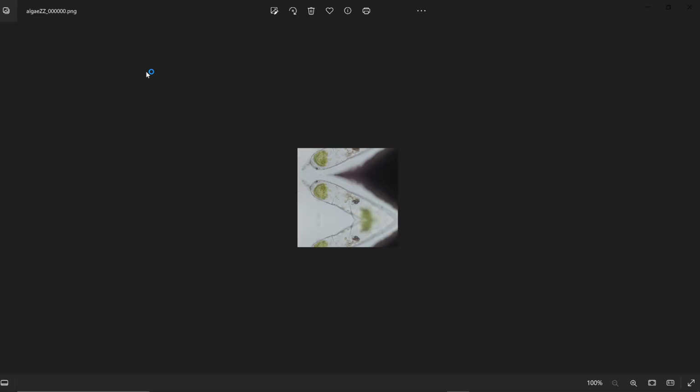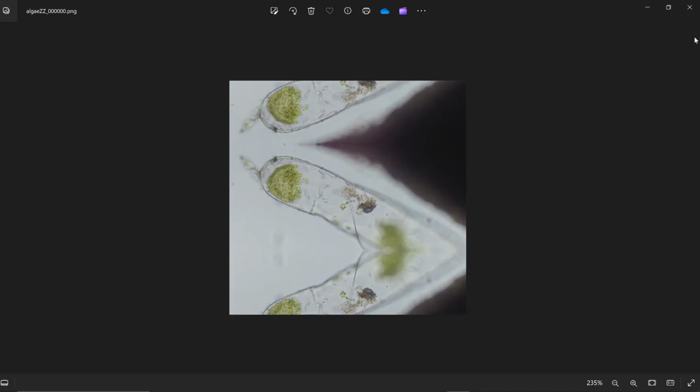Now, you can imagine this being useful when you have images that capture the entirety of an organism. But if you're not, this may actually impose a bias on your data to always detect objects that are symmetrical. Depending on the application, of course, this may be useful in some circumstances.